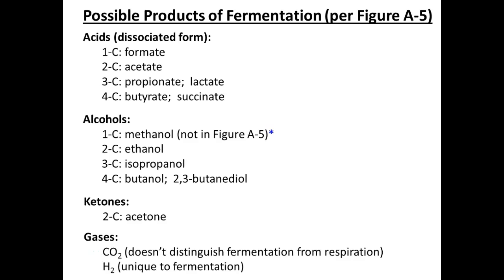Gases are either carbon dioxide, which is difficult to distinguish whether it was from fermentation or respiration, right? It's produced in both processes. But hydrogen gas is unique to fermentation.